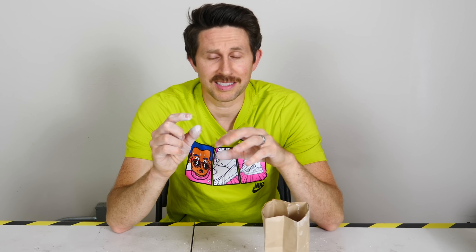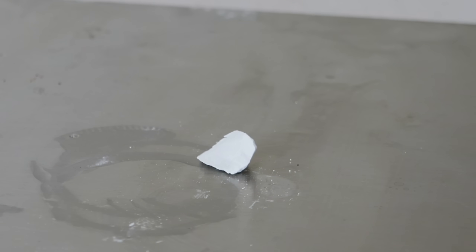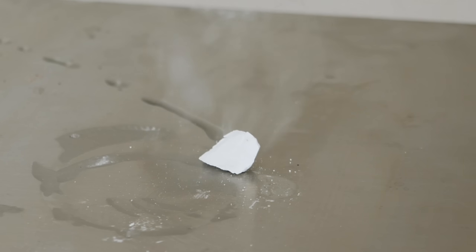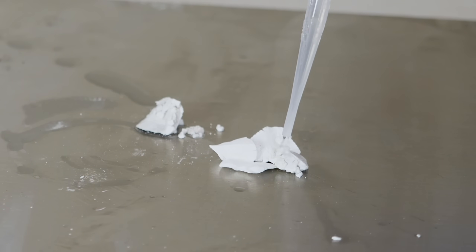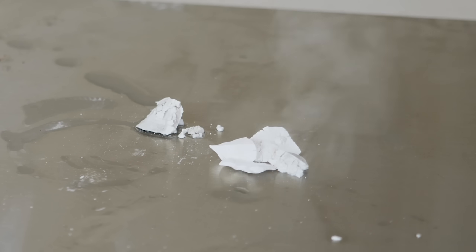So now this calcium oxide that I'm holding isn't hot at all — it's completely cooled down. I can hold it in my hand, but watch what happens when I put water on it. [Water is added — strong exothermic reaction observed.]